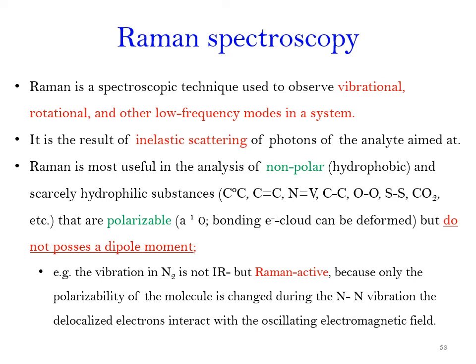So it is a result of inelastic scattering of photons by the analyte molecule. Inelastic scattering means there is energy exchange. So Raman is the most useful in the analysis of non-polar or hydrophobic and scarcely hydrophilic substances, which are IR inactive, or that don't have a dipole moment. Molecules that don't have a dipole moment can be polarizable, and so they can be detected by Raman.